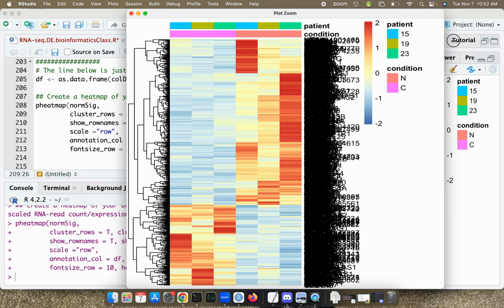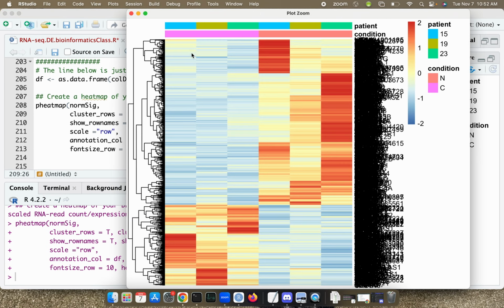So what we're looking for here, when I mean blocks of expression patterns, we see this big blue block in our cancer sample. And we see another big blue block down here, and then we see these redder blocks on the corners. So here it's showing for all of these genes, there's patterns of slight underexpression. So blue right here is underexpression. 0 would mean equivalent expression between cancer and non-cancer, and 2 is going to mean, and redder is going to mean, higher expression.